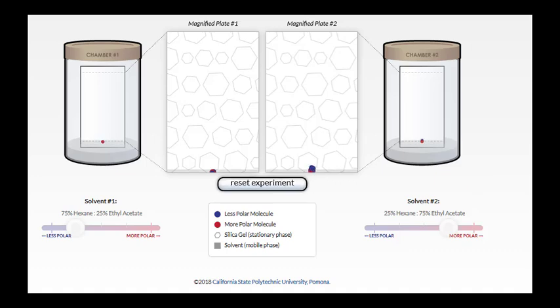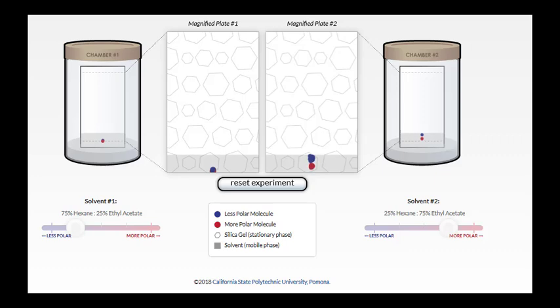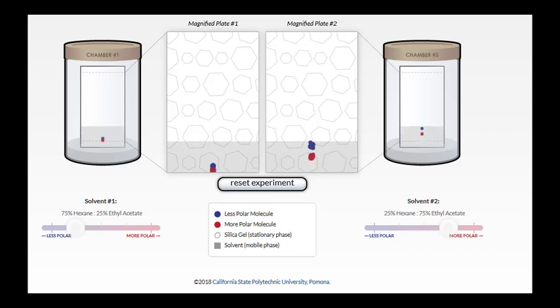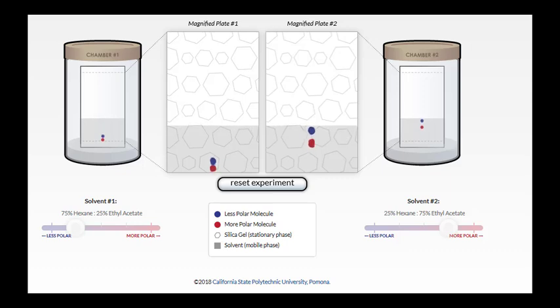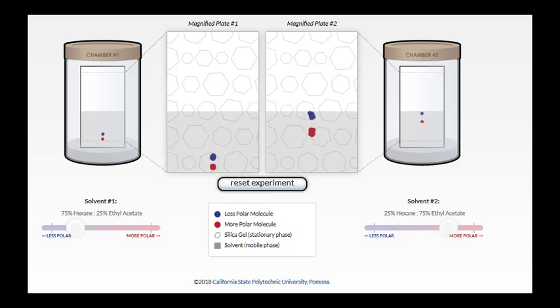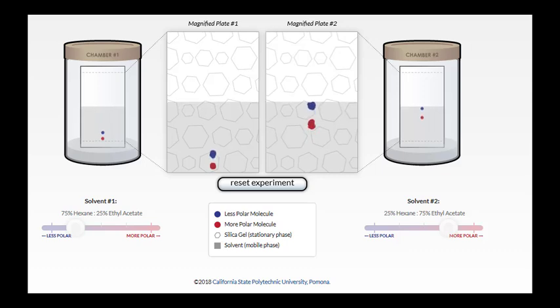So we're going to start our experiment and see how that affects the RF of our spots. Once again, the solvent's going to rise up the plate, and the components are still going to separate, but we're noticing that with a more polar solvent, the compounds seem to be traveling at a faster rate.